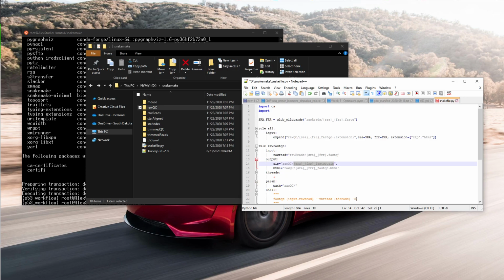That's with a lot of these tools. So we have to create a parameter, which is just like a miscellaneous ID or a miscellaneous variable here. And then we can put that down here. So we can do params, it needs an S, params.path. Now it's going to look in the params for a variable called path, and then it's going to spit that out.